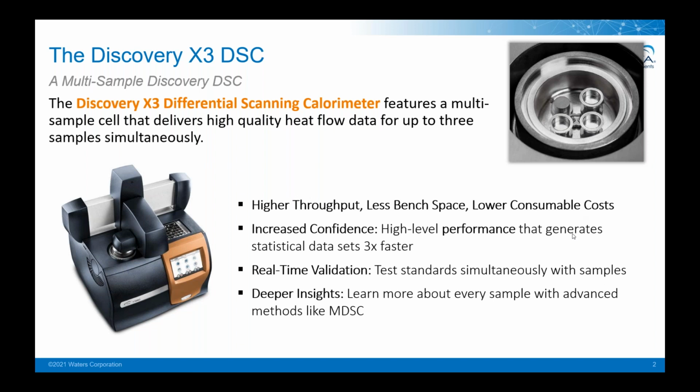Clearly the advantages, some of the obvious advantages obviously are higher throughput. You're running potentially 3 samples at once. You're combining the efforts of 3 instruments into 1 instrument, so you're saving bench space.